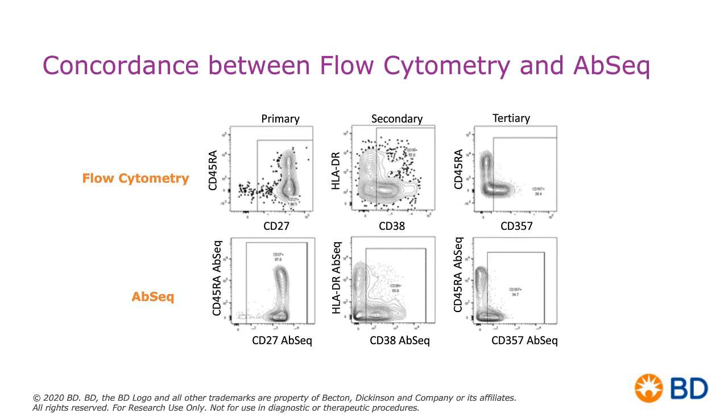And if I look at my scale on my y-axis and I look at 0, I can see that the spread of my negatives goes all the way up to 10 to the third, which is a significant amount of spread, all the way down to minus 10 to the third. And that's using my bi-exponential scaling so I can visualize that entire CD45RA population.